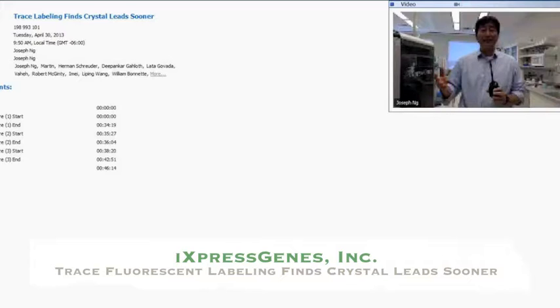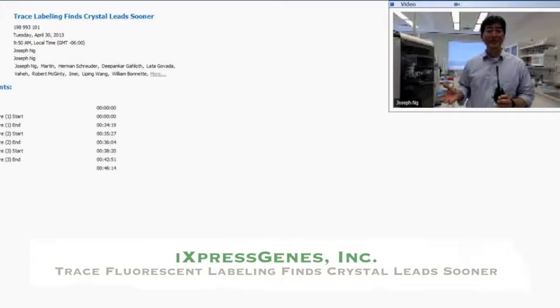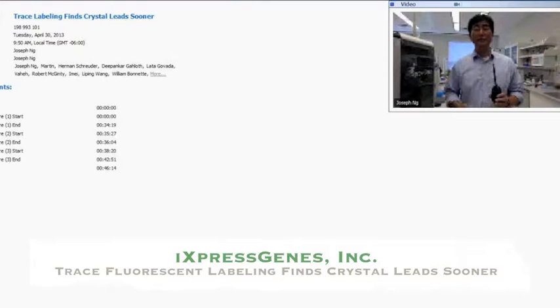If I compare it with the fluorescence, and I'm saying this on a one-on-one because we did look at this, we see that it's more consistent in results. And as I mentioned earlier in the talk, it is safer and much simpler because you're not dealing with ultraviolet radiation. So if you're in a laboratory where safety is concerned and that is a limiting step, I think the LED becomes much more advantageous.